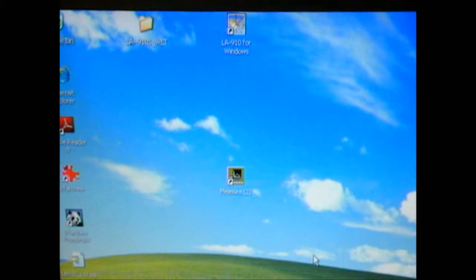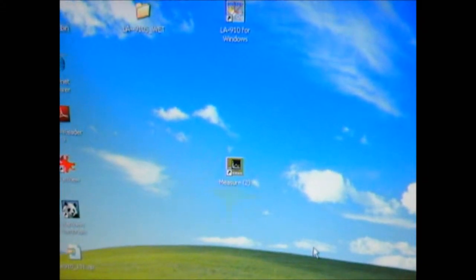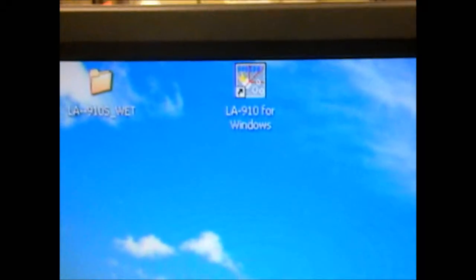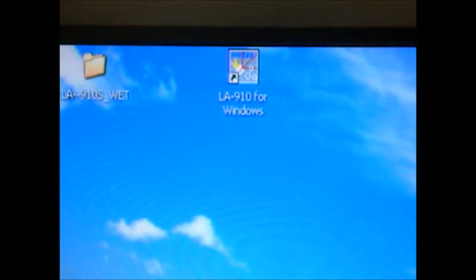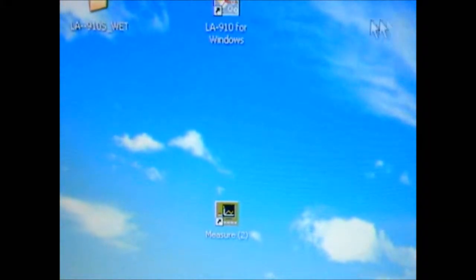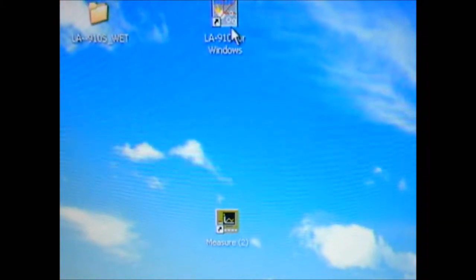When the software is loaded, you should see two icons — one on the bottom that says Measure, and one on the top that says LA-910 for Windows. You want to click on the one that says LA-910 for Windows.